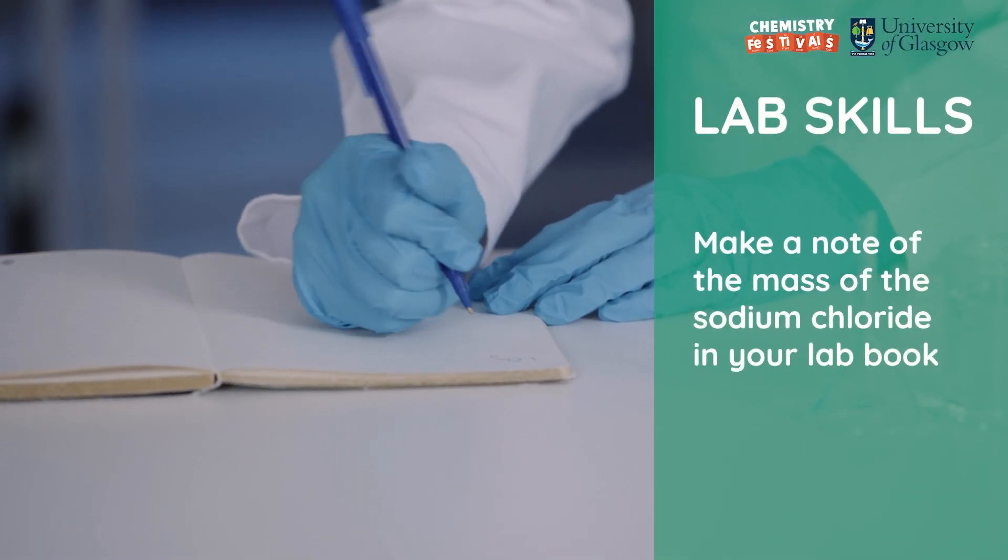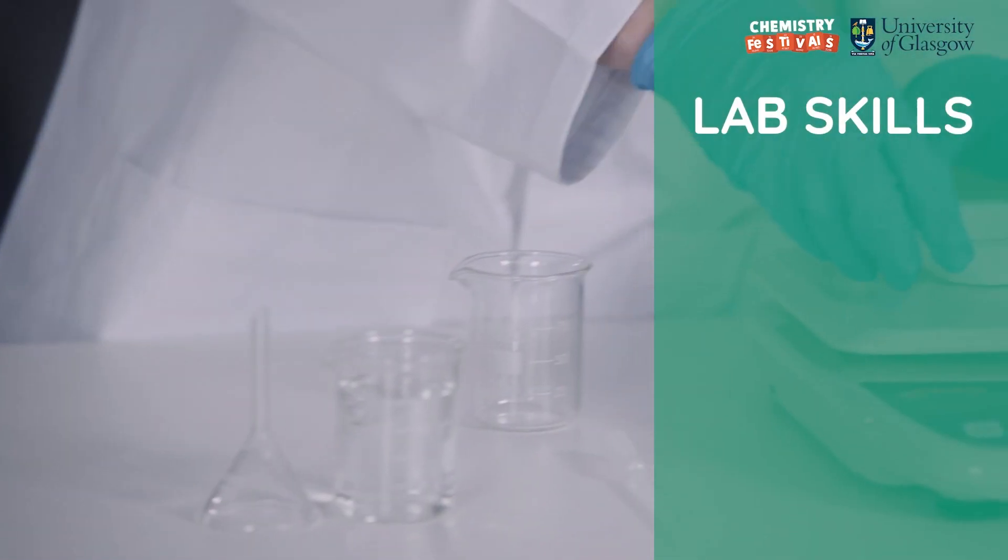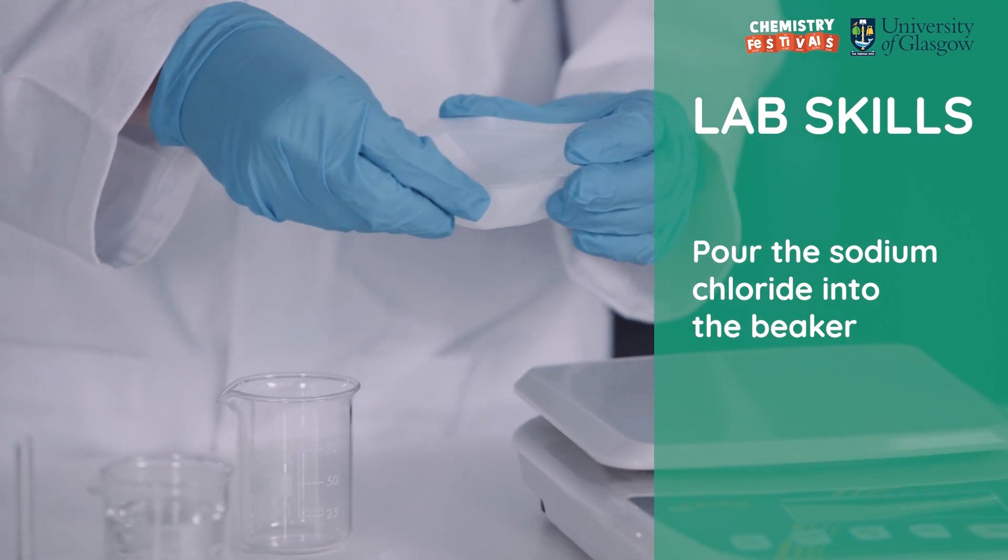I then note down the mass of the sodium chloride. I pour the sodium chloride into the beaker.